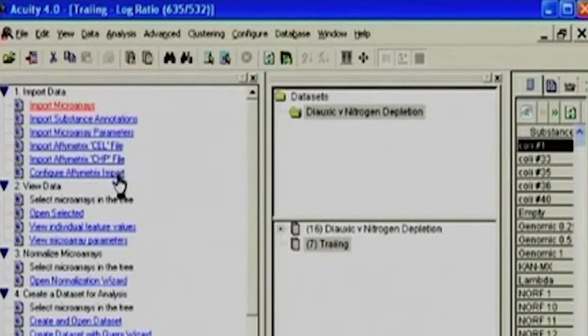The other 3 you are seeing are based on Affymetrix, which is actually a CEL file. Their image is actually a DAT file, which they convert to the intensity level CEL file. That can also be handled, but it does an RMA analysis, where they have moved a little bit further for a different kind of analysis. But it does give an opportunity even to look at Affymetrix outcome data. And then you have viewing data.